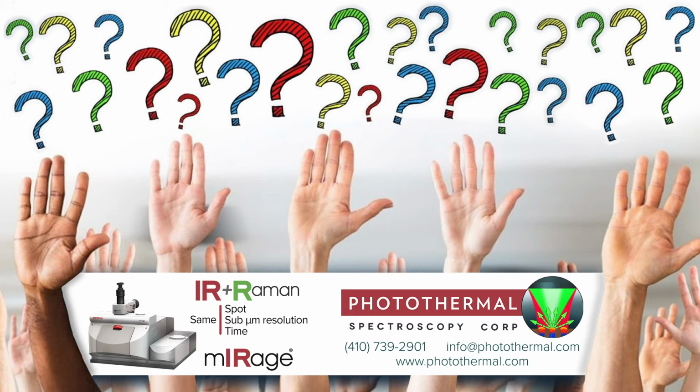I haven't done it, but if you had the QCL sitting at one band and always on, so you're always exciting at one, and did the Raman on that versus having the QCL off or on a non-resonant band, might there be some Raman enhancement by virtue of there being an infrared? I don't think you get a Raman enhancement. Would it not be analogous to having resonance enhanced Raman? No. No, ignore me. It was a suggestion somebody made. I'll blame them. I don't know. I don't think so.